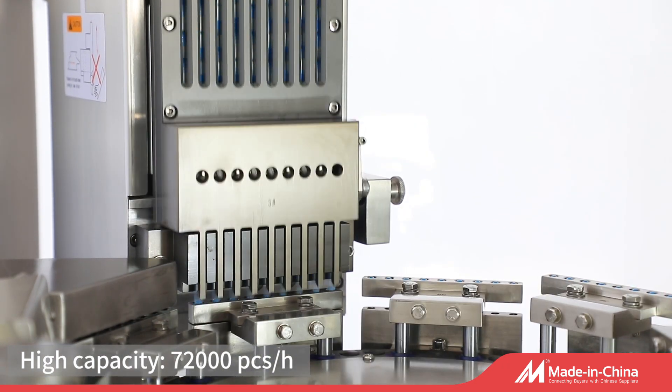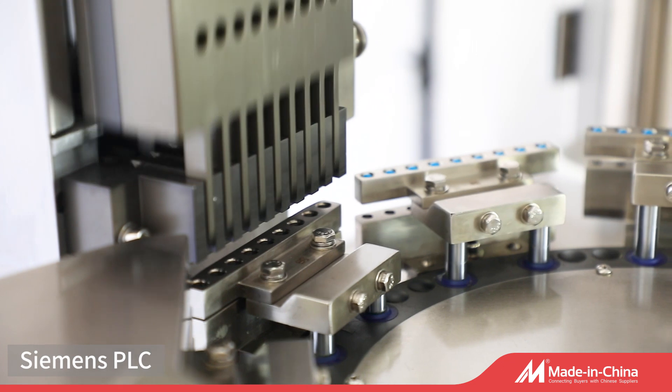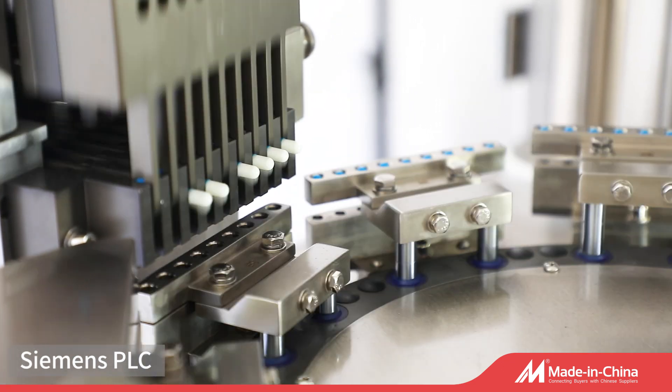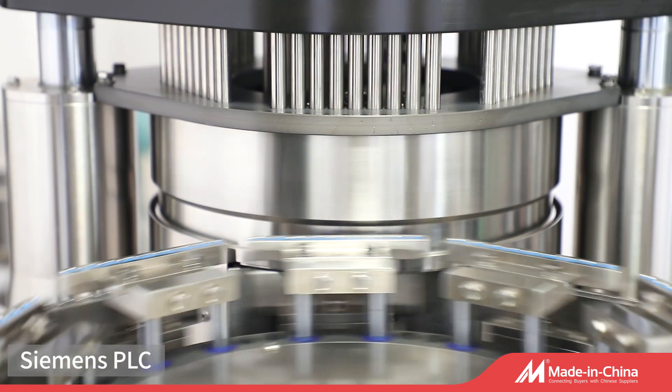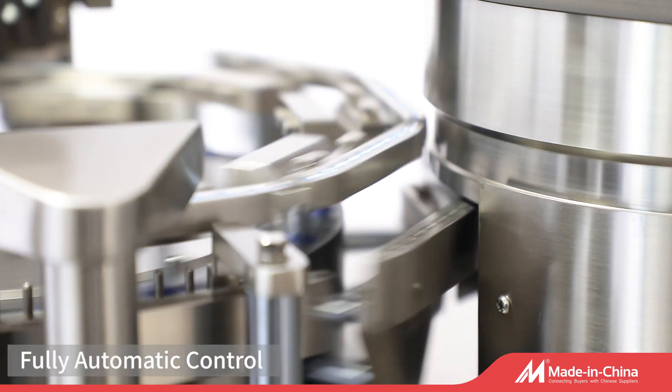The lower components are mechanical and electrical components that drive the capsule filling process, which consists of parts like motor, vacuum pump, drive belt, safety clutch, and air compressor.